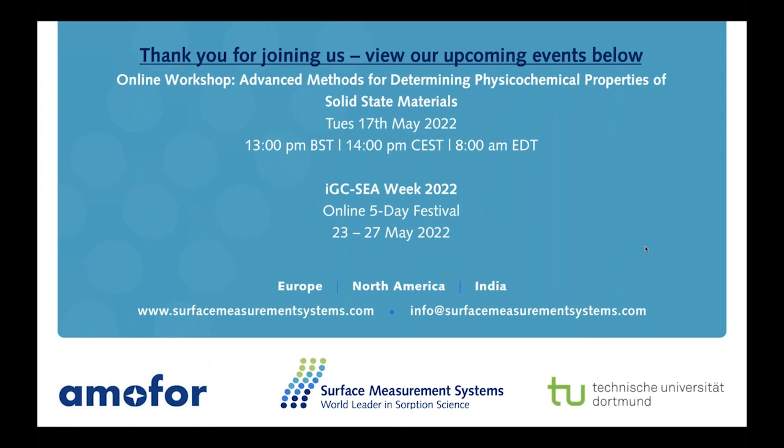Yes, you would be able to see multiple glass transitions or phase transitions within the same sample just by using a similar methodology to this. If you were to notice multiple inflection points while doing this type of experiment, you could find different glass transition temperatures or different glass transition humidities, as long as these inflection points were quite far away from each other and weren't interacting with each other or interfering with the gradients that we could observe either side of the maxima and the minima.